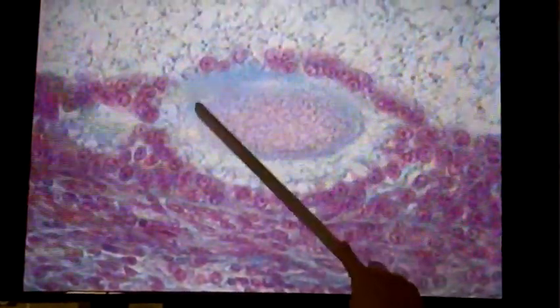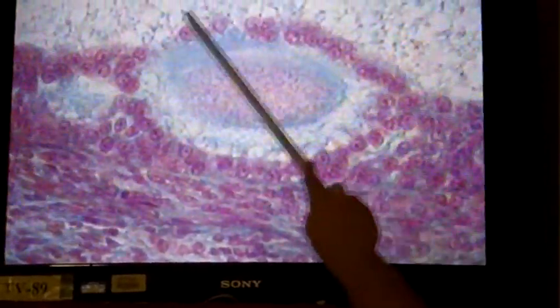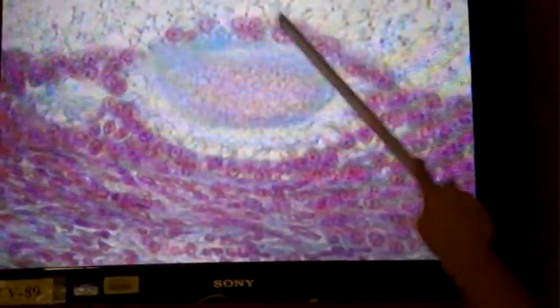You see the ovum down at the bottom, the corona radiata, and you can see your vesicular material here inside of the antrum there. What would be the corona radiata on that? It's like the whitish area, right up under the purple. Do you see the bluish area? That's the zona pellucida. And then the cells that are stretching around it would be the corona radiata. Gotcha.